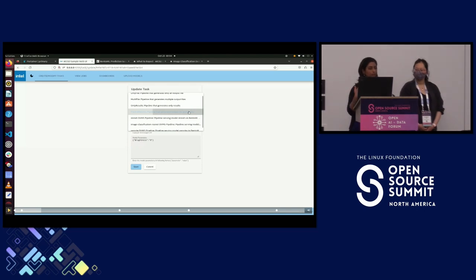We wanted to build something where we give in an input and we just get back an output. So this is a simulator. And then from the dropdown, we select the pipeline which needs to be run. Here we selected the file and results pipeline. That means when I give the input image, it gets processed and it's going to generate an output file as well as a result.